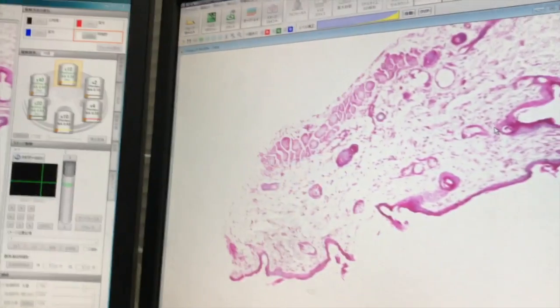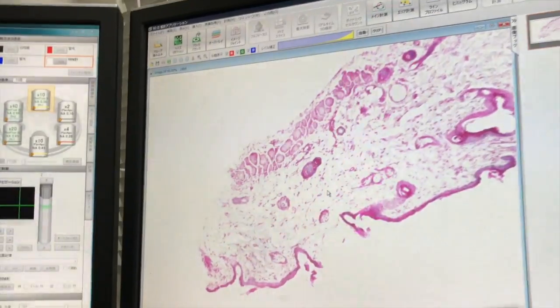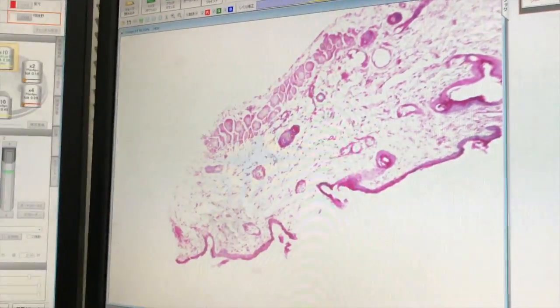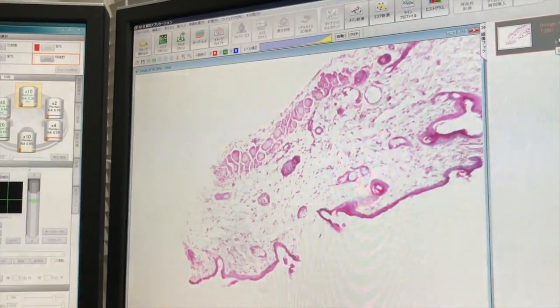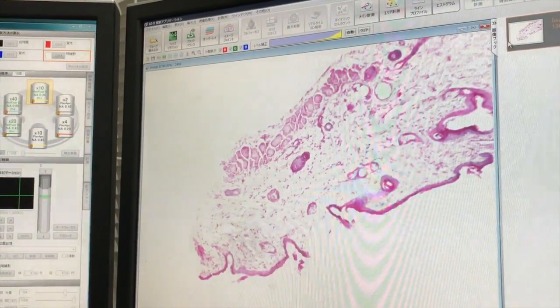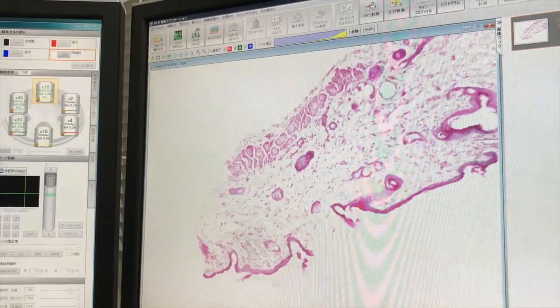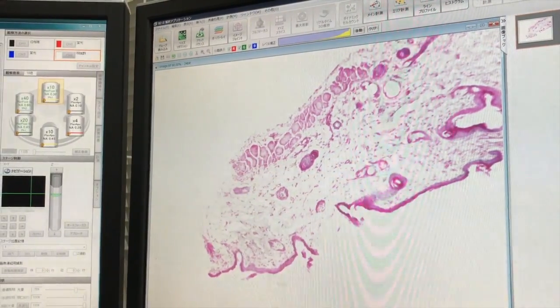You can add any folder as you like. But it's not yet saved. Yes. It will open. This is the... Oh, directly after saving? Yes, yes. It will open in here. Okay. So I have to save. So this is already set in the folder.